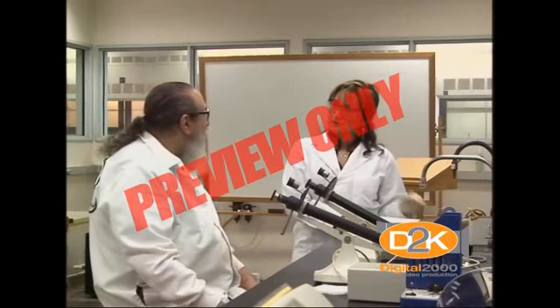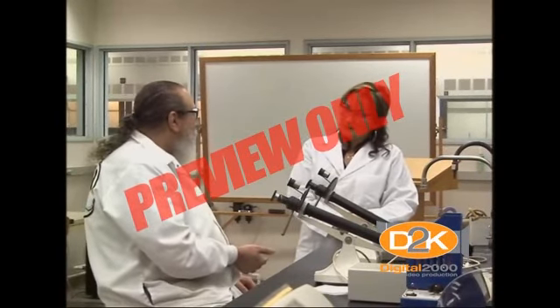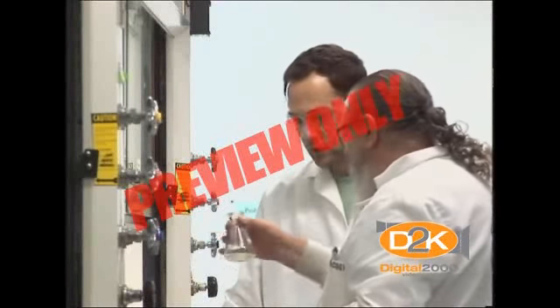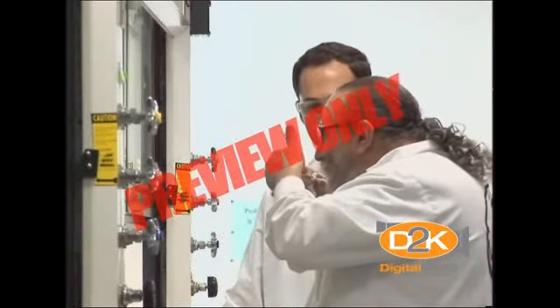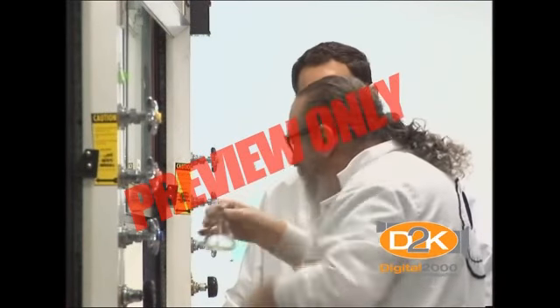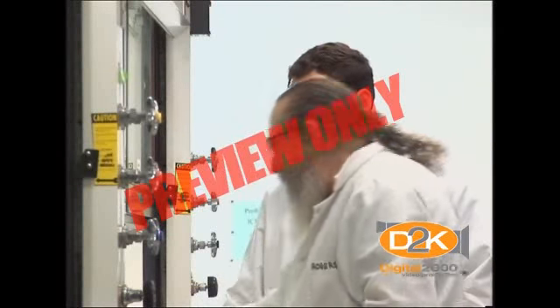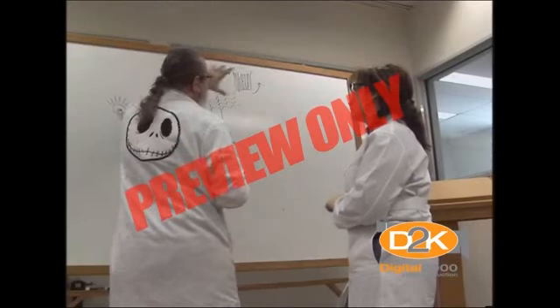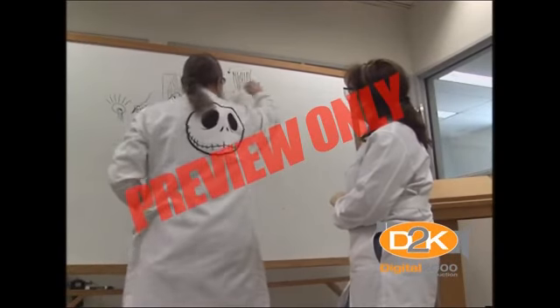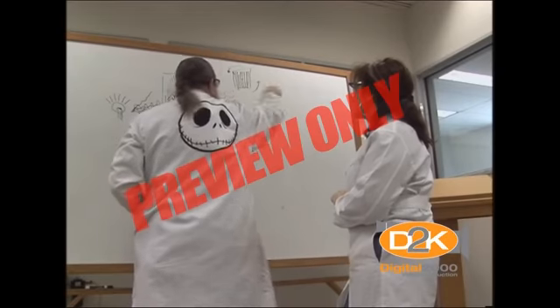In addition to general training, you must receive training specific to the laboratory in which you work. This training must include such topics as risks associated with the hazardous substances in the laboratory, physical hazards present in the laboratory, proper use of instruments and safety equipment, and laboratory procedures and protocols. Each individual laboratory, corresponding department, and the Environmental Health and Instructional Safety Department retain documentation of such training.